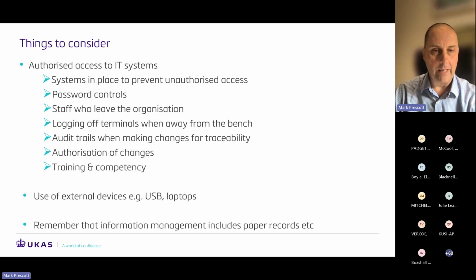You know, it does go beyond the actual main LIMS that you're using. And as a final point, just to bear in mind that this whole discussion about information management does include paper records as well. Yes, we've all moved over to electronic systems by and large, but there are still lots of paper records in some laboratories, an awful lot in some.